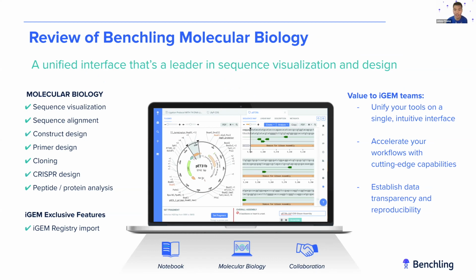There are tons of features that we offer and that we're going to go over today, such as sequence alignments, construct design, and so on. But especially for iGEM teams, we actually have the ability to import parts and sequences from the iGEM registry. We've heard from previous iGEM teams who have used Benchling that it's a great way to unify their tools in a single place, accelerate workflows with cutting edge capabilities, and really establish data transparency for everyone.